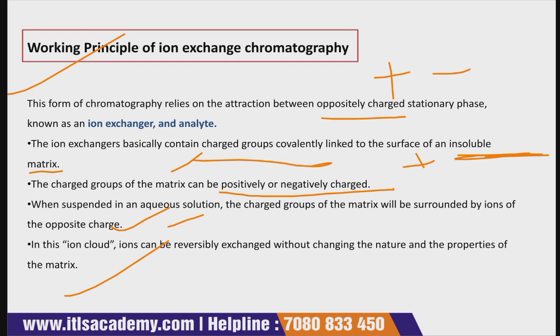We have studied different types of chromatography, and ion exchange is one of the important types that comes in your question papers and interviews. Apart from ion exchange, HPLC and thin layer chromatography, these three have a huge demand in your examinations. So you must be aware of the working principle of ion exchange chromatography.